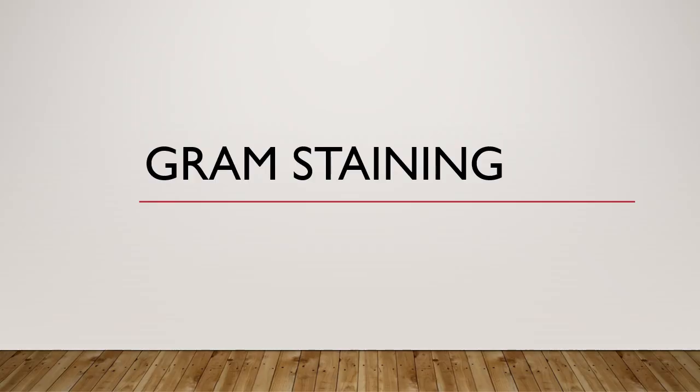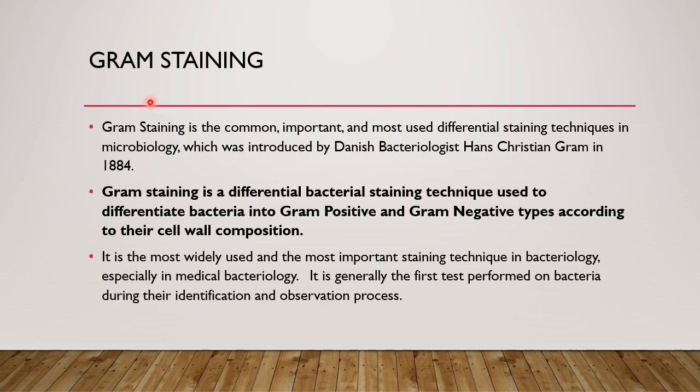Welcome to today's video tutorial on gram staining. Okay, let's get started. Gram staining. So gram staining is the common, important and most used differential staining technique in microbiology, which was introduced by Danish bacteriologist Hans Christian Gram in 1884.